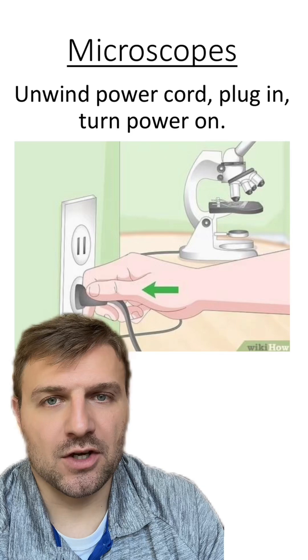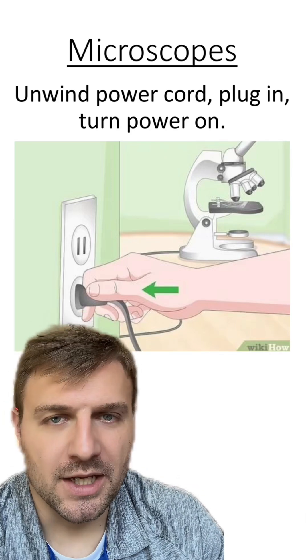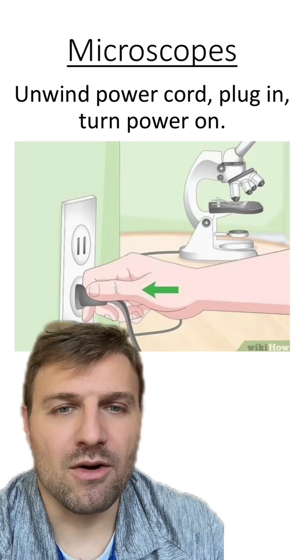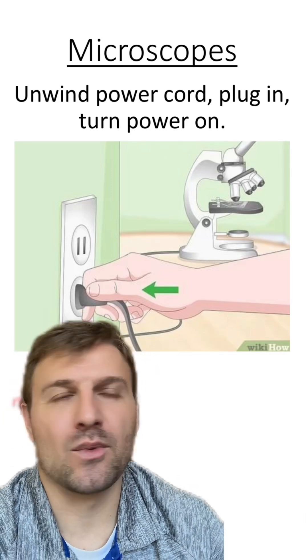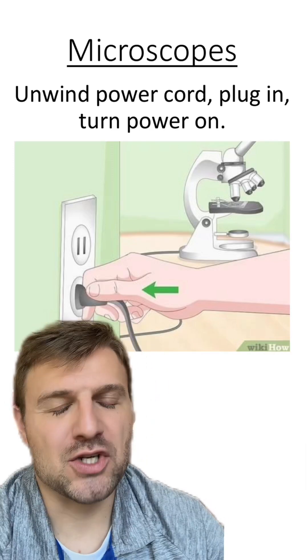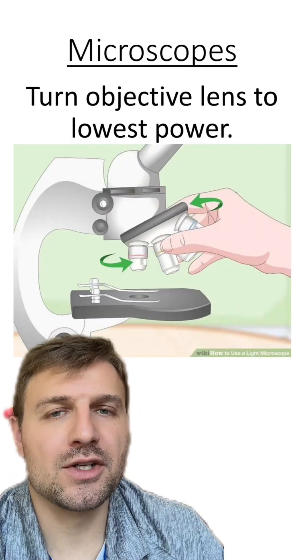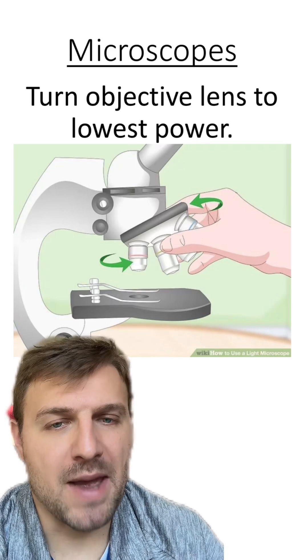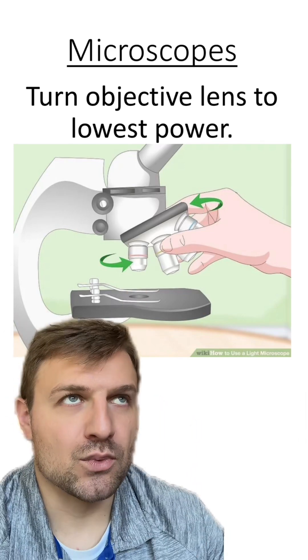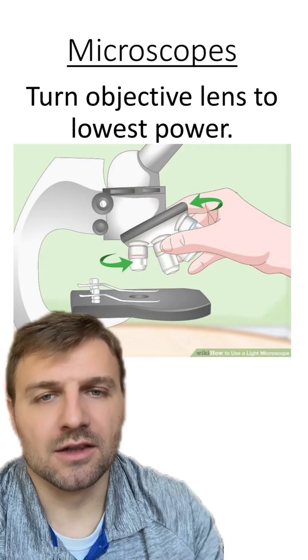How do we actually use these microscopes? First, you're going to unwind the cord and plug it in. And don't forget to turn the power on. Usually, students will forget this and ask, why isn't my microscope working? So just make sure the switch is turned on. Next, you're going to flip the objective lens to the lowest power. That's usually in red. It's really important to always start at the lowest power.